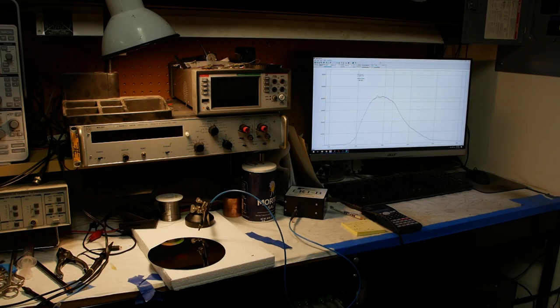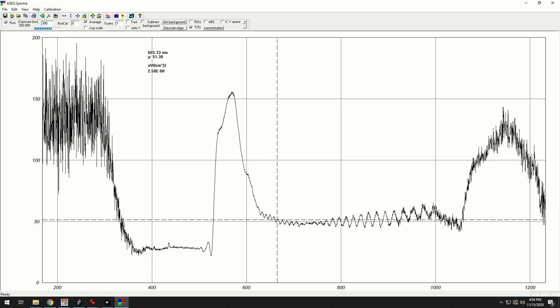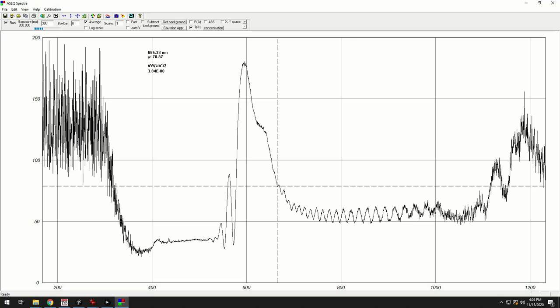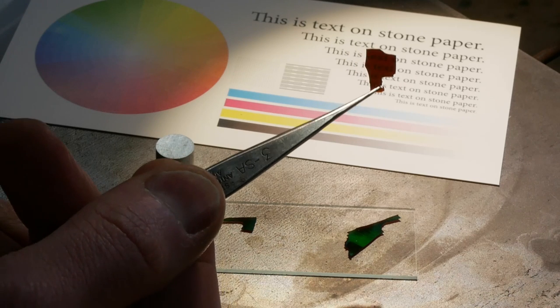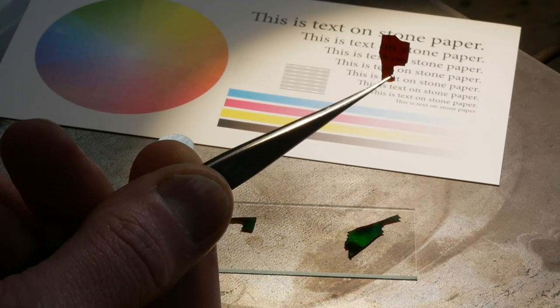Let's take some measurements from the wafer itself. Here's the setup where I have an incandescent desk lamp facing down into the wafer. And then the optical fiber, which is the input to the spectrometer, is aiming at about the same angle into the wafer. And then as I move the wafer around, we'll be able to pick one of the filters to inspect. And then I'll also set up the spectrometer to read off in percent so we can see how good or bad the filter is relative to just the plain old silicon wafer. So here's the percent reflect from the green filter. And notice that the spike is above 100% because the filter is actually a better reflector of green light than the silicon wafer is itself. Same for the red filter, even more effective in terms of reflectivity.